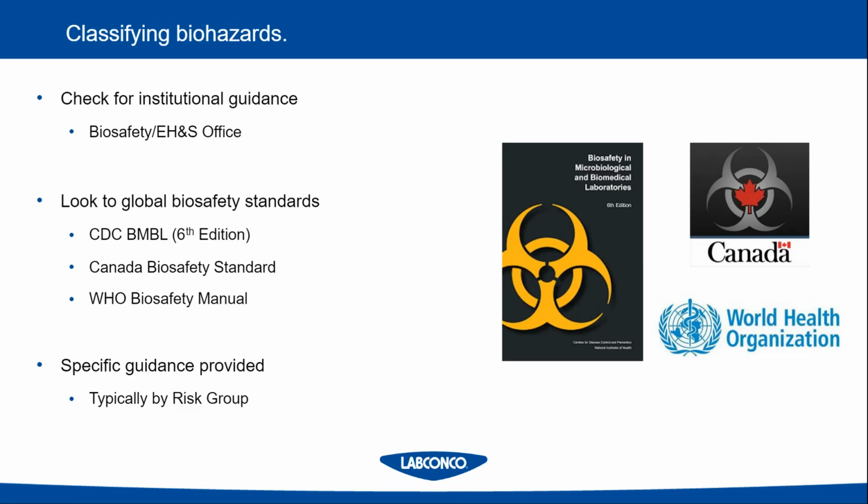So in this case, there would be contamination of the samples on the inside, and there would be breach of containment to the lab. So if it was not used correctly, let's say if they had the sash open too high or too low, or didn't even use the blower and just used it as a dead air lab space, in this case, there would be not good things. So the users would be infected from whatever's on the inside, and whatever's on the inside would be contaminated from the lab.